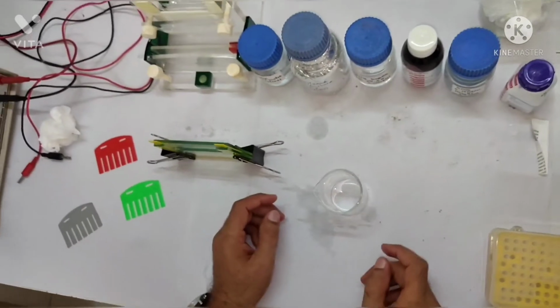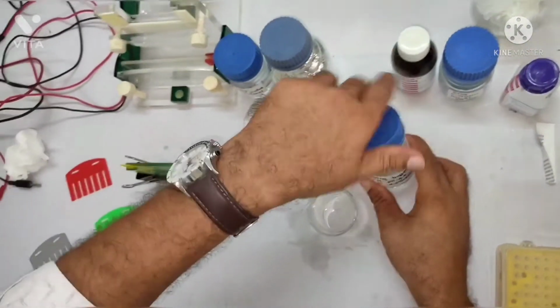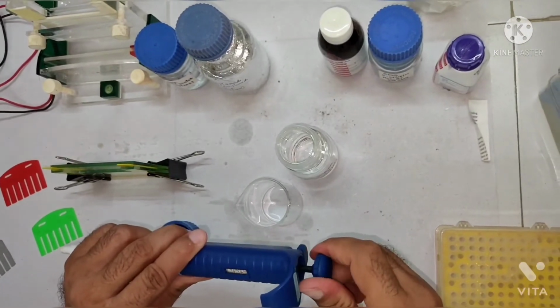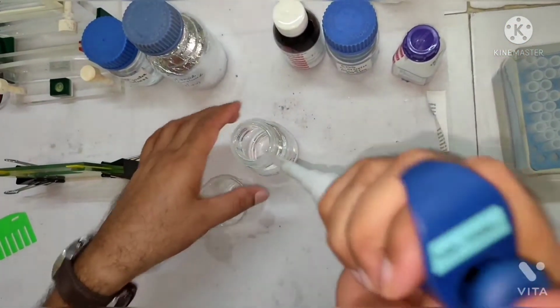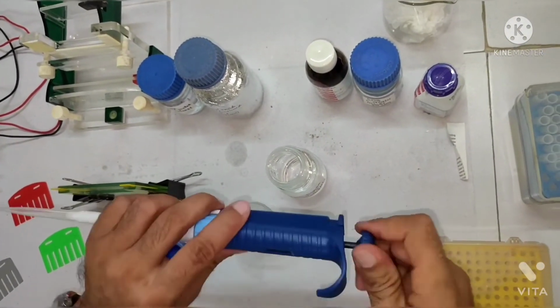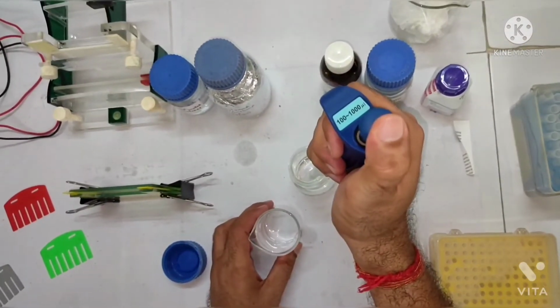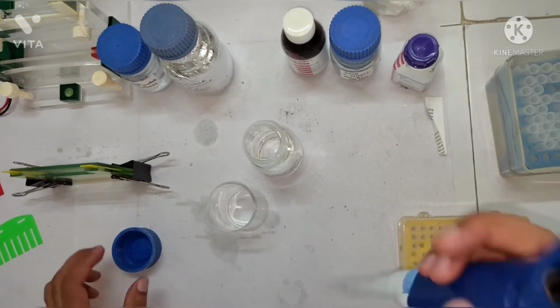Then the third component is Tris, I mean the stacking buffer, 0.5 molar Tris, pH 6.8, and this is 1.25 ml. First I'm adding 0.25 and then another 0.25. Always mix it properly, then 1 ml. Mix it well, mix it properly.